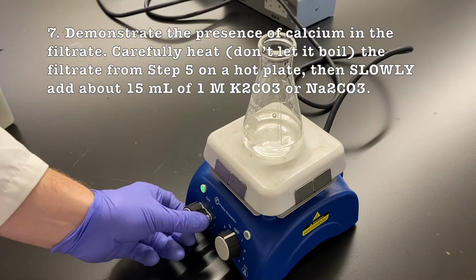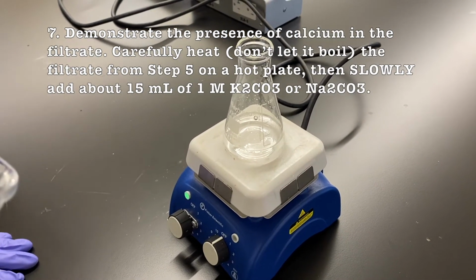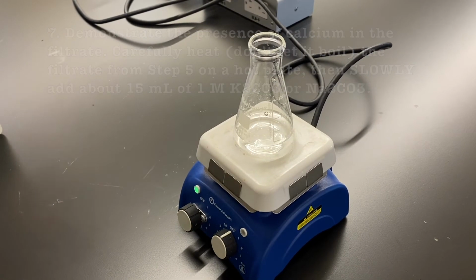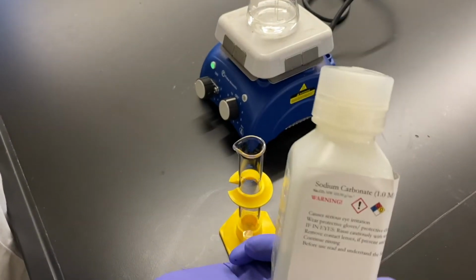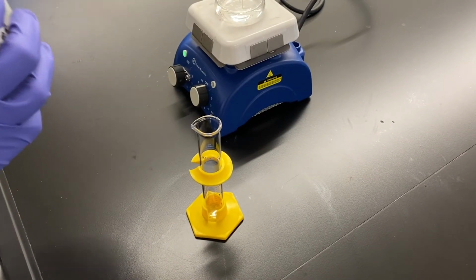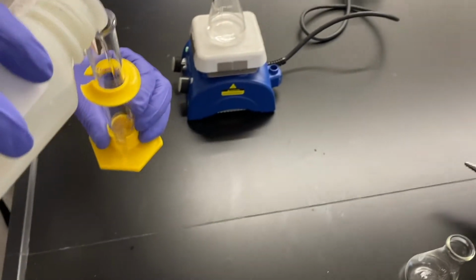Almost. So now we just have our solution that has the calcium in it. It's also a little bit acidic because we added the HCl. We're going to add some sodium carbonate. And so that carbonate's going to combine with the calcium to reform calcium carbonate. And so we'll show you the calcium's still there. It didn't go anywhere. It just dissolved in the water.